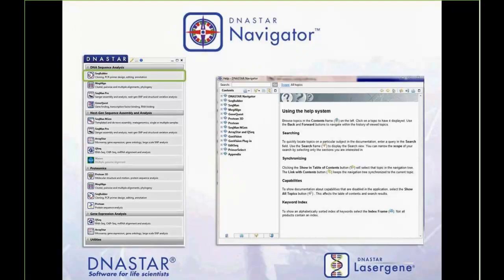There's also a help index on the right-hand side there that shows you direct links to all of our help menus that are built into the software, as well as the ability to do Boolean searches. So if you wanted to search within, say, SeqBuilder and search, say, cloning at the same time, it will search all the different applications that fit cloning as well as SeqBuilder, the software.